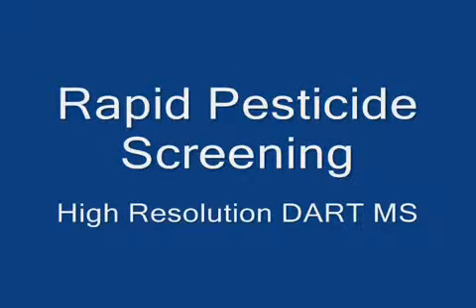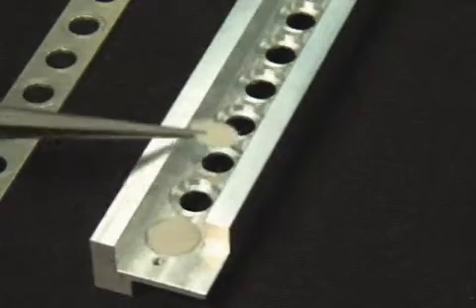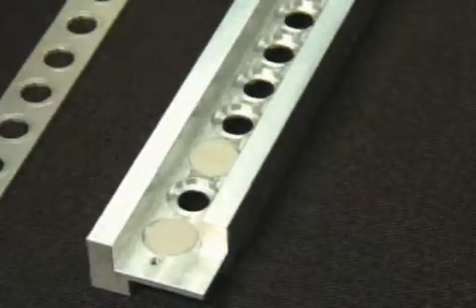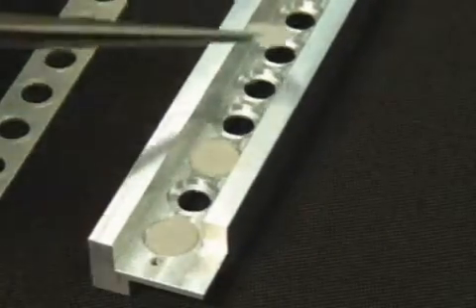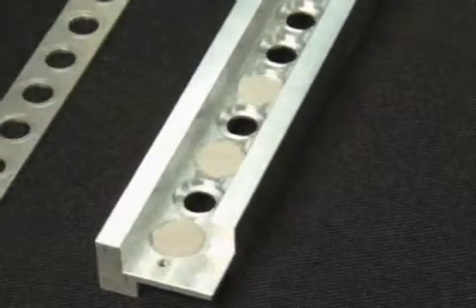Rapid pesticide screening can be completed utilizing high-resolution mass spectrometry and the DART ionization source. Prior to this analysis, scientists at the FDA collected samples on small polyethylene sponges. These sponges are now positioned in the new flow-through screening carrier.